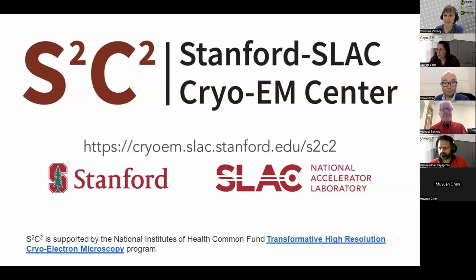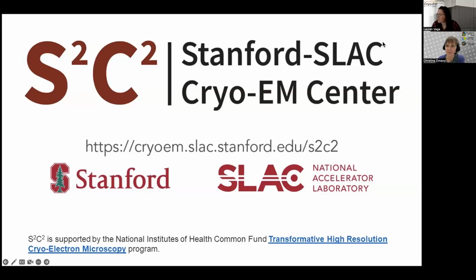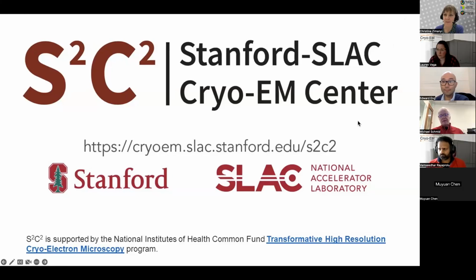Hi, I'm Mike Schmidt from the Stanford SLAC cryoEM Center, and we have 3, now becoming 4 Krios microscopes and a Talos Arctica and soon to have a Tundra. We have all the specimen preparation equipment, including Chameleon, and soon to have Vitrajet.